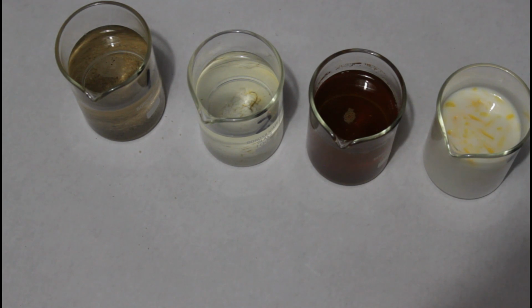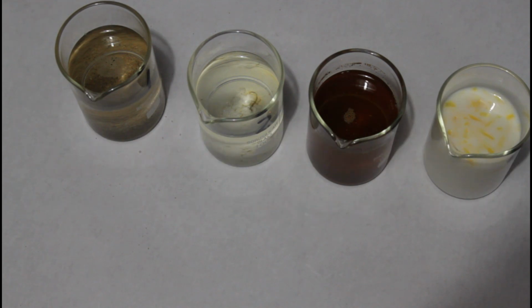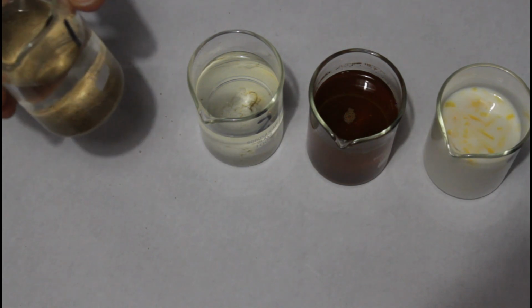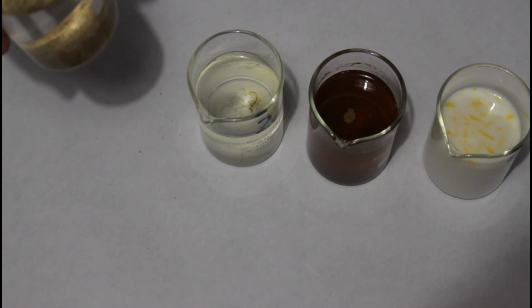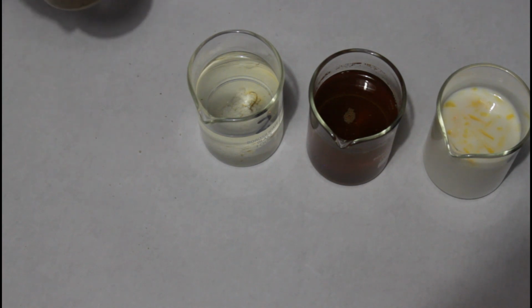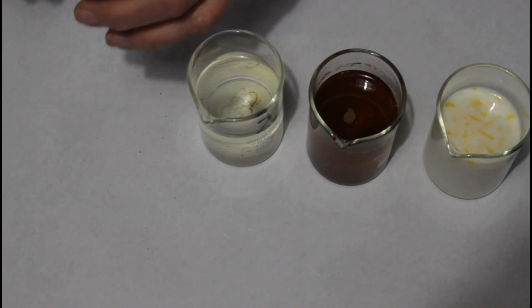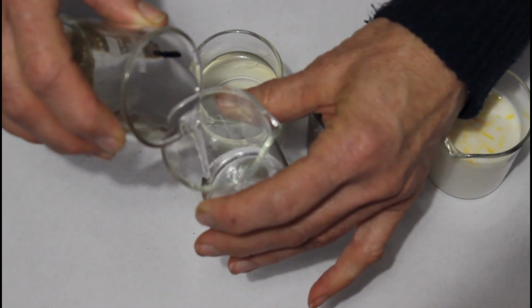So we have settling, which is one of the methods that we can separate things. And then we have another thing which is called decanting. And decanting says I can pour the top layer off. So decanting would work very nicely with this sand and water, because we would be able to pour off quite easily. So I'm going to do that right now. I'm just going to decant very slowly.